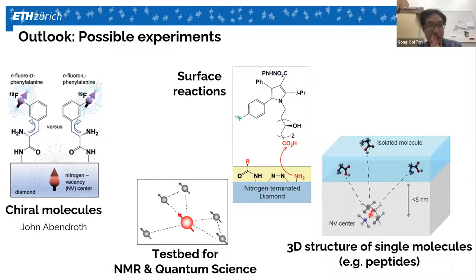Okay. This also answers my second question, because if I'm not mistaken, what you do now is you align your microcoil, and this is on a single crystal sample. Right. So we have a microcoil simply for applying broadband RF pulses. The microcoil is not tuned. It has a bandwidth of 20 megahertz. This is the little microcoil that appeared on the bottom left. It's solely here to do NMR pulsing. It's only transmit, not detect.